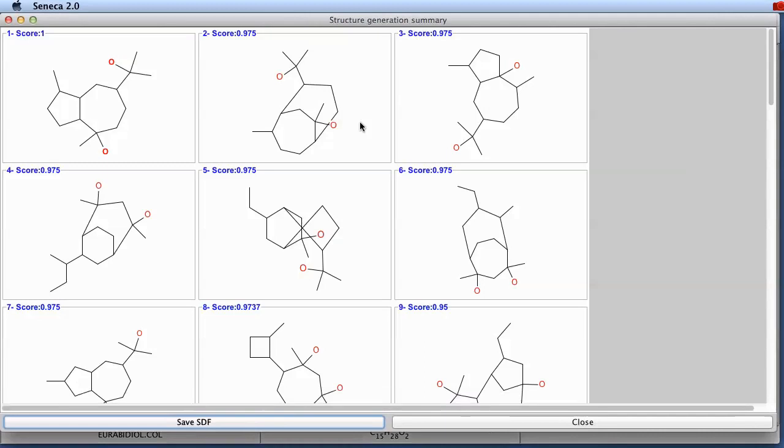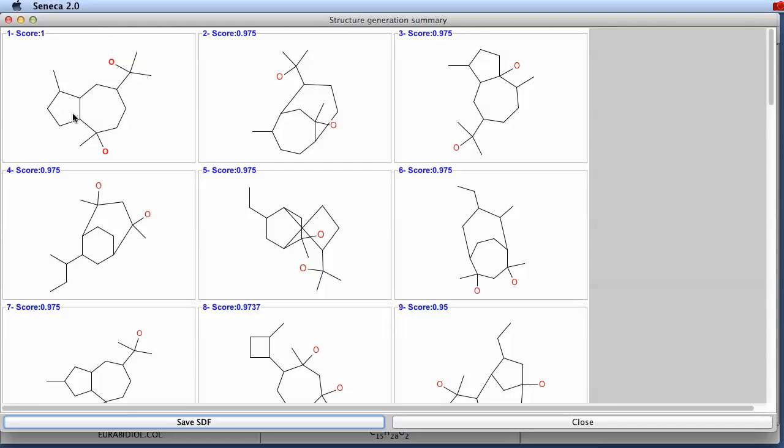And you can see here, this is indeed, this is the best structure with score one. Here the score is normalized between zero and one with one being the optimum score. And this here is actually the correct structure for Eurobidiol.